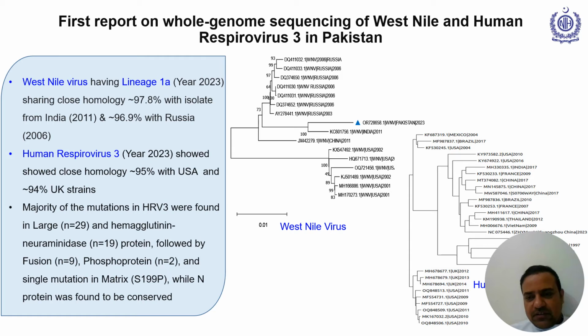Initially, he was suspected to be a case of Nipah, but we used PCR and found the sample to be negative for Nipah. So we again used a metagenome sequencing approach, and in the blood sample we found that the patient was infected with West Nile fever virus. Again, this is not common.